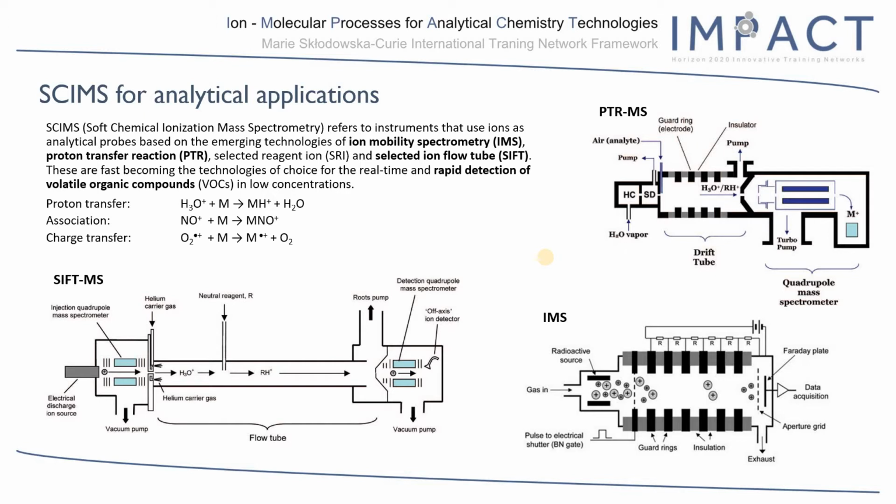The power of each of these instruments relies on ions rapidly reacting with other molecules. If the ion chemistry of these ions is understood, the instruments can be easily used. However, the ion chemistry can be also very complex. For such situations, it is useful to simulate if the proposed ion chemistry agrees with the experimental observations. And that's why we built KIMI.